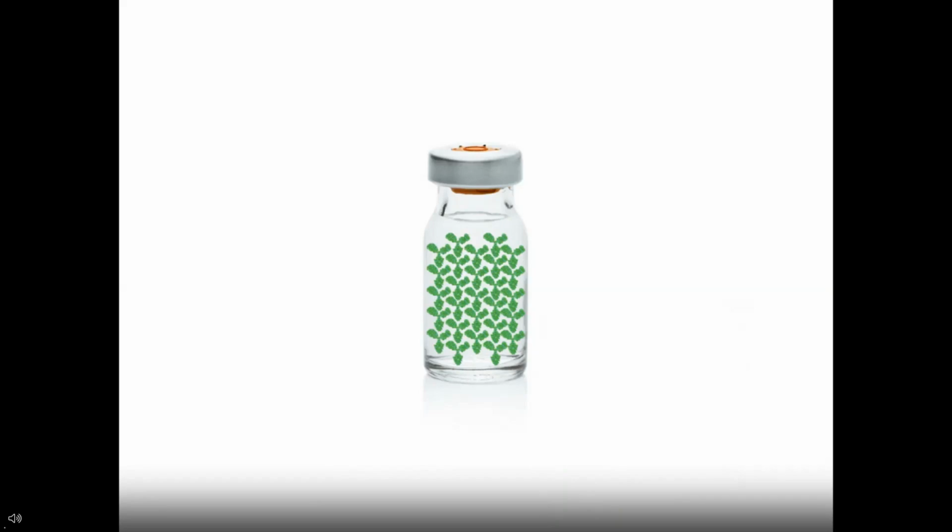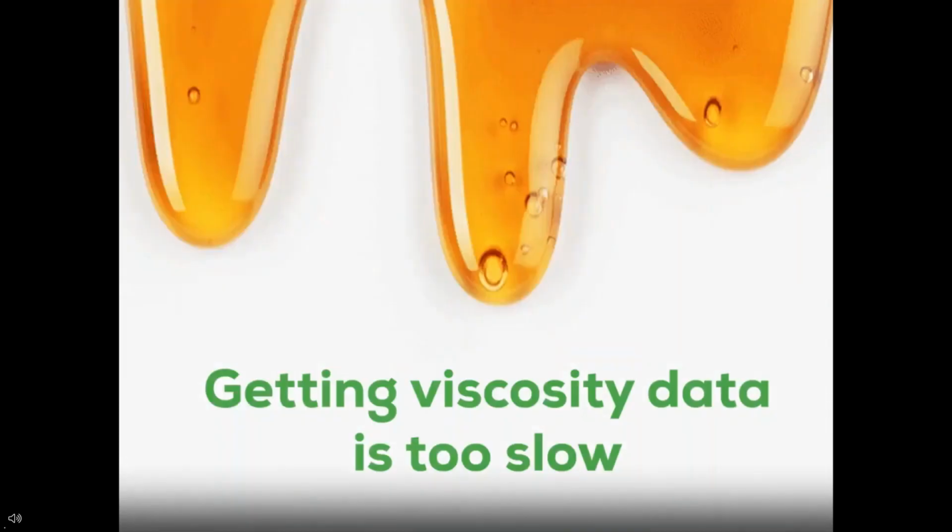When you're developing a drug for injection, viscosity is the biggest factor telling you if your sample will struggle with syringeability or injectability. In the worlds of antibody engineering and formulation, viscosity raises the alarm when your antibody is prone to sticky self-interactions or if your formulation isn't going to cut it. In process development, high viscosity can lead to issues with filtration or fill-finish processes.